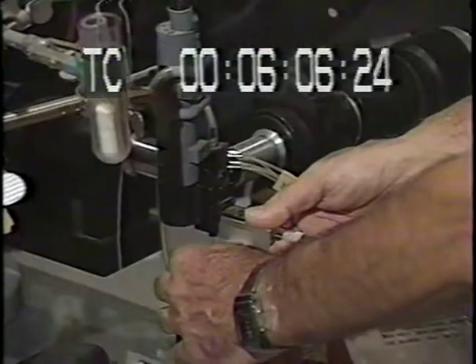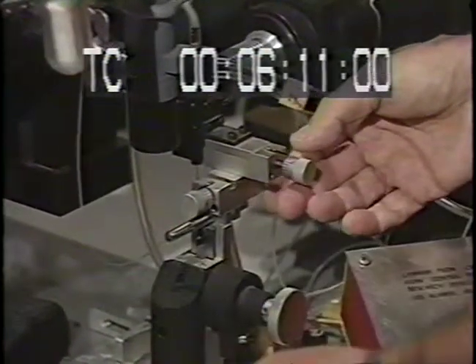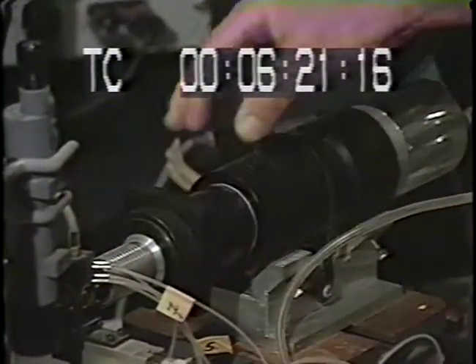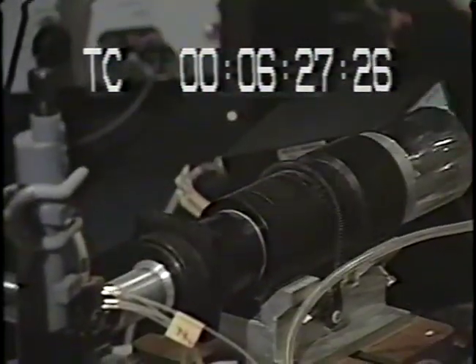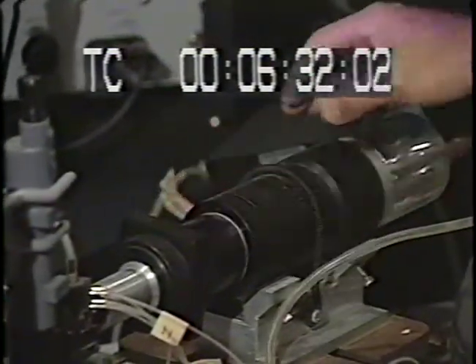This is from, I believe, an old microscope. It was adapted for a micromanipulator, I'm not sure. And then here is the optical part. It's a lens and a photomultiplier that looks at the intersection of the beam.